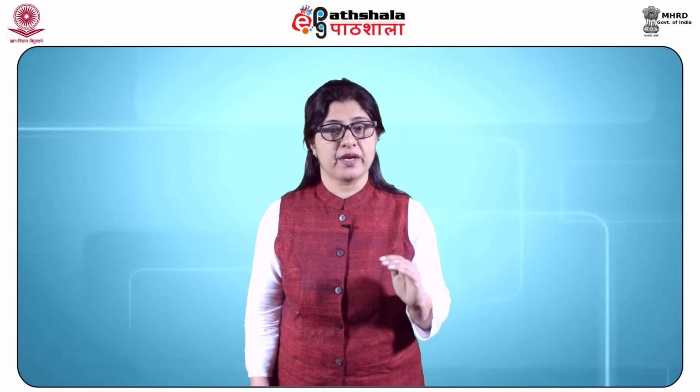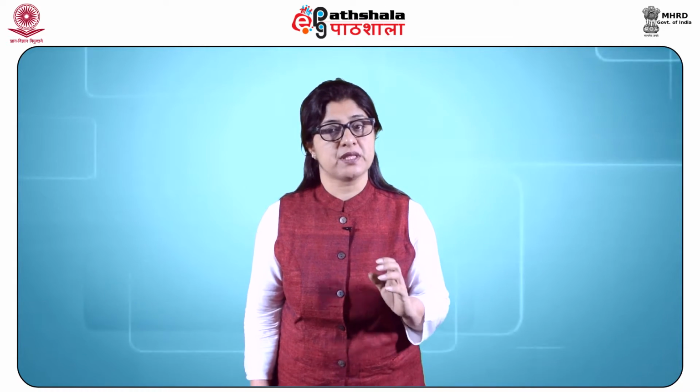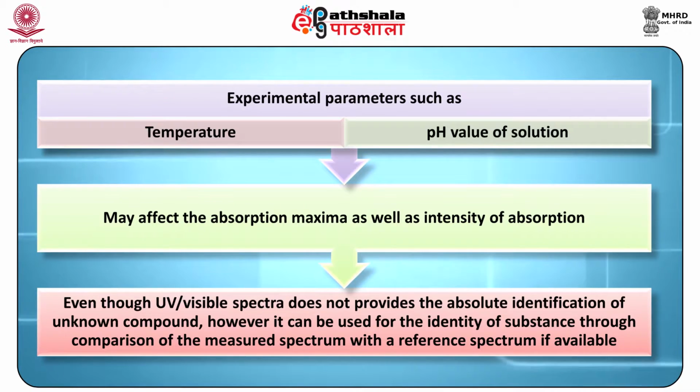However, the position of absorbance maxima is not fixed even for a particular chromophore, as it depends upon the nature of the whole molecule, the presence of auxochromes, and also on the solvent in which the sample is dissolved for recording the UV visible spectra. Experimental parameters such as temperature and pH of the solution may also affect the absorption maxima as well as the intensity of absorption. Even though UV visible spectra do not provide absolute identification of an unknown compound, they can be used for identifying a substance through comparison of the measured spectrum with the reference spectrum, if available.